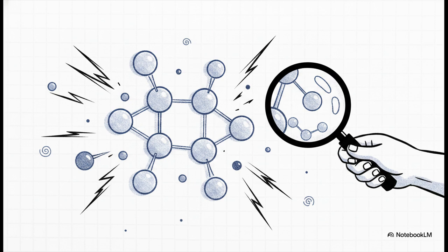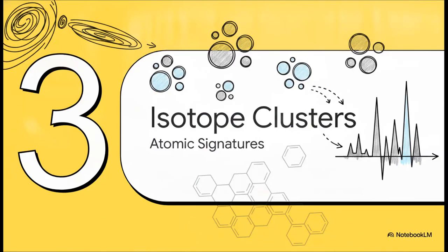If a molecular ion is highly unstable, it might have a lifespan of less than 10 to the minus 5 seconds. It will literally shatter into fragments before it can even make it to the mass analyzer. If that happens, well, our strategy has to adapt. We might have to switch to a much milder technique, like chemical ionization, to gently protonate the molecule and find its mass, or we have to play the ultimate puzzle game and deduce the original weight by piecing all the fragments back together.